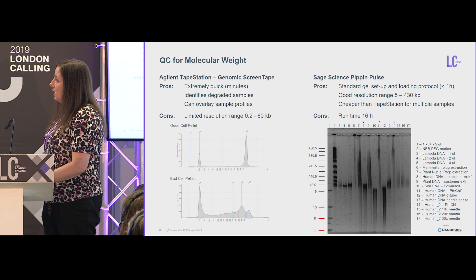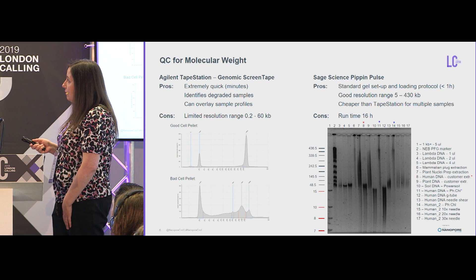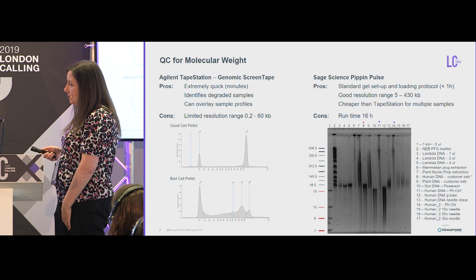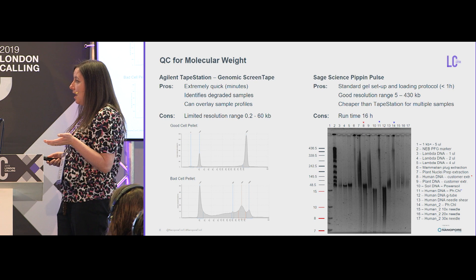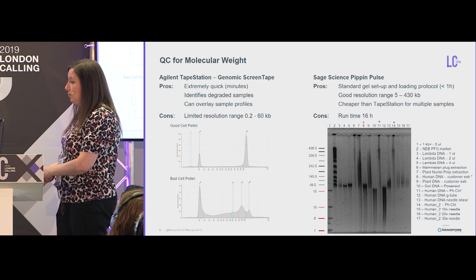The Pippin Pulse we've found quite useful. You can see the resolution of the 48 kb lambda genome sent as a control with most ONT kits. Our phenol-chloroform extractions show quite high molecular weight — you get a compression zone which indicates you might have megabase DNA in your samples. We also see this from plug extractions. When we do extractions in-house we get a nice high molecular weight profile, but customer samples sent to us are sometimes much lower molecular weight. The Pippin Pulse is also very useful for examining the size distribution of sheared material following needle sharing or g-tube shearing.